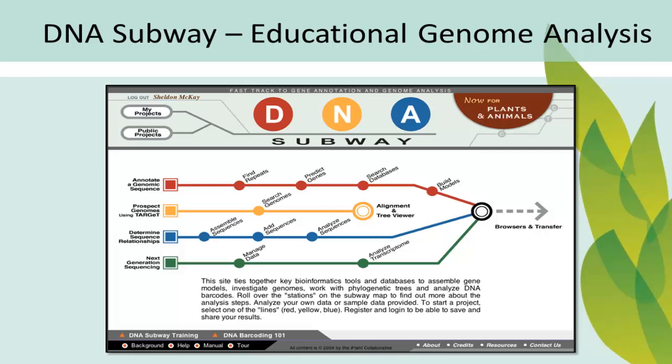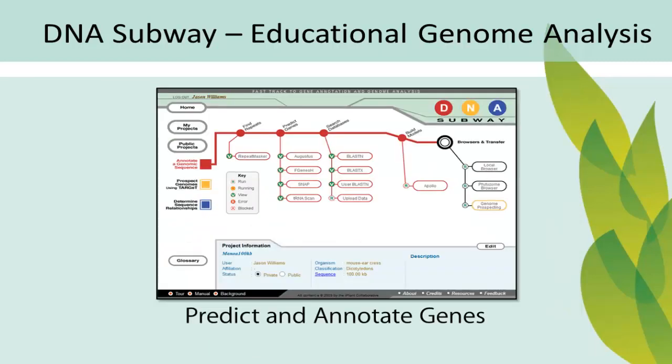Riding on any of four different DNA Subway lines, users can use the red line to predict and annotate genes in up to 150 kilobases of DNA from both plant and animal genomes.